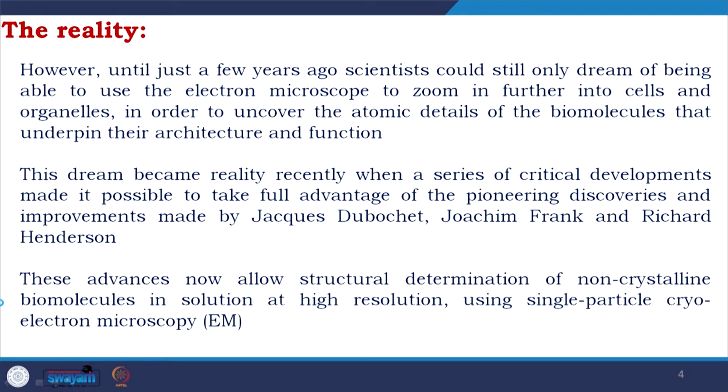These advances now allow structural determination of non-crystalline biomolecules in solution at high resolution using single particle cryo-electron microscopy. Through this journey, I have repeatedly talked about how important it is to get the 3-dimensional structure of the biological macromolecule, especially protein. But the challenges we have already discussed about crystallography. It is a very convenient technique.